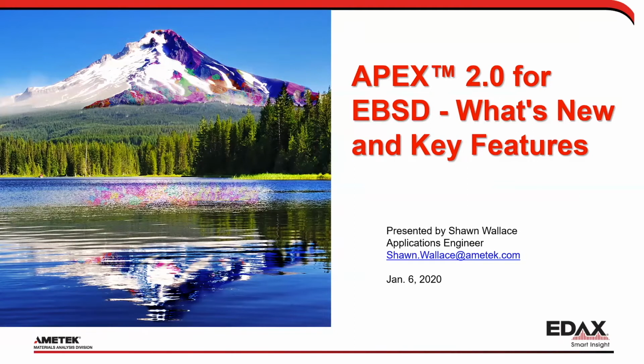But let's talk about Apex 2.0 for EBSD, what's new, key features, and why we did some things differently than Team. So, of course, first I have to kind of talk about what is Apex. Let me go ahead and get my pointer back up.